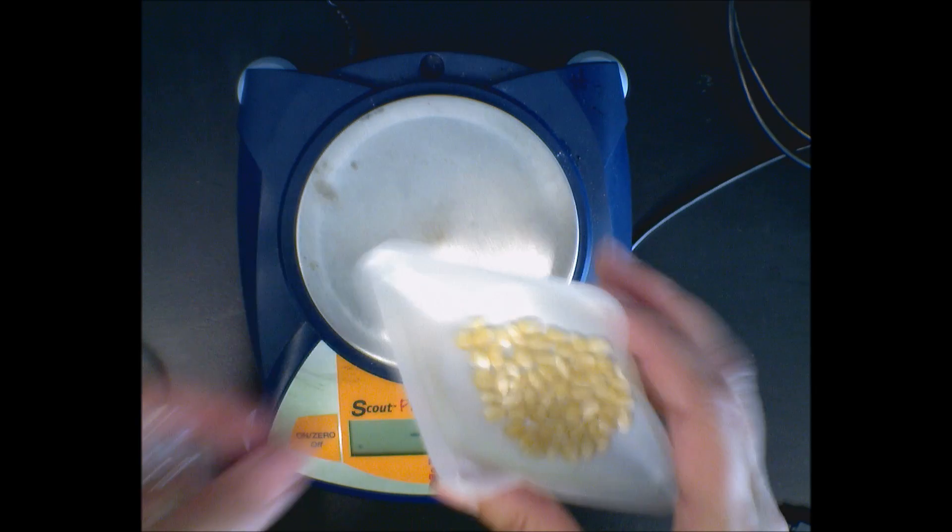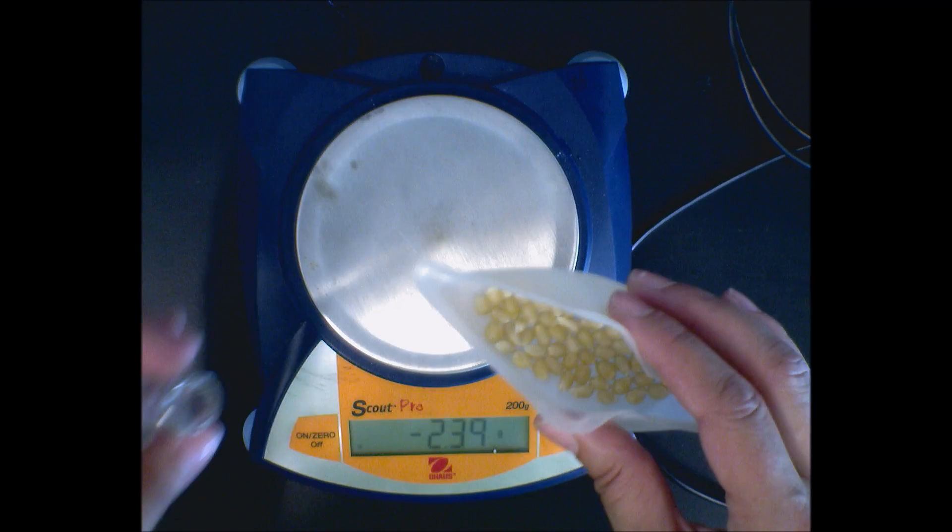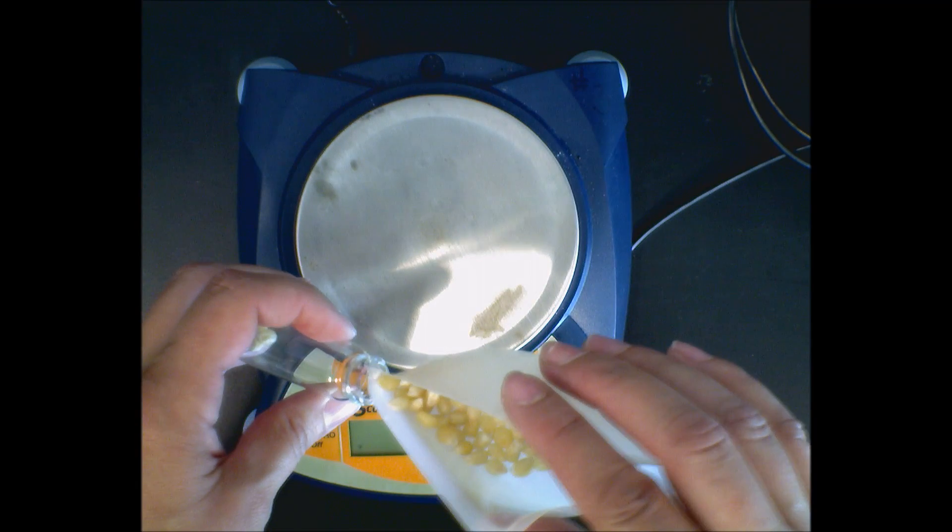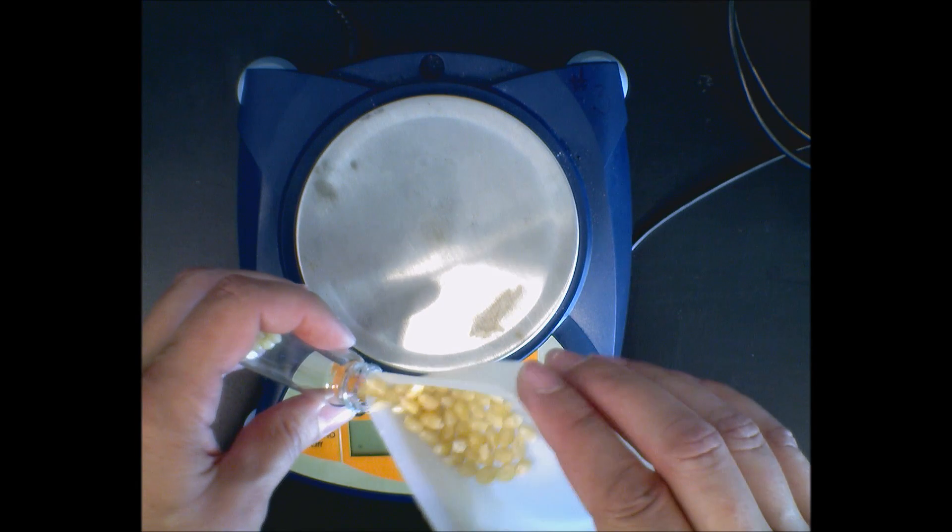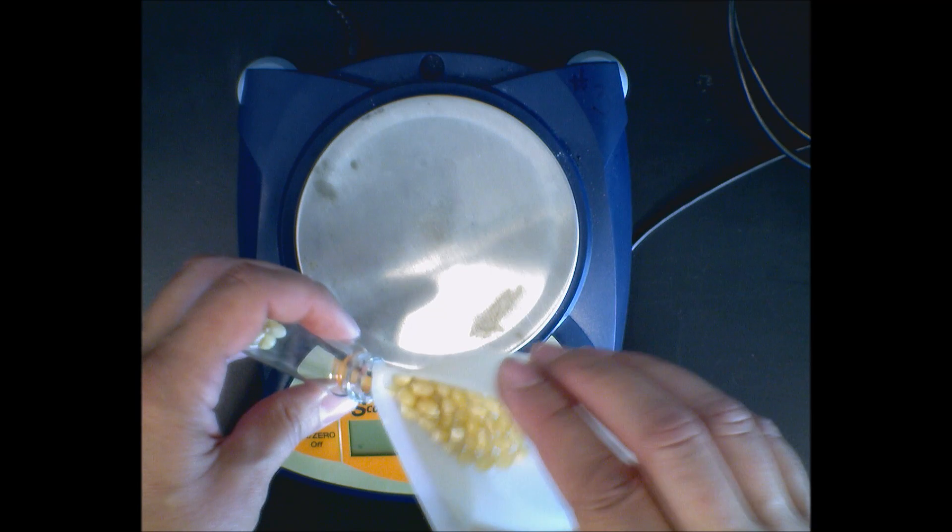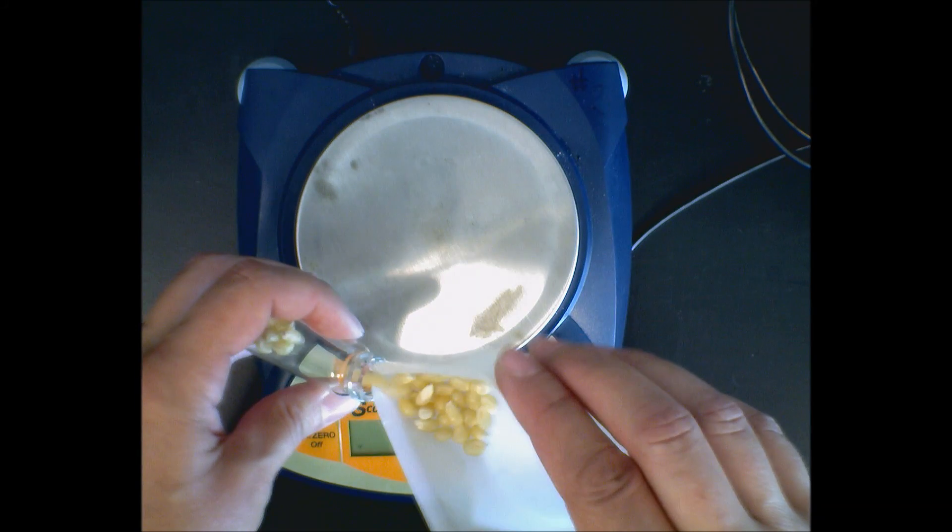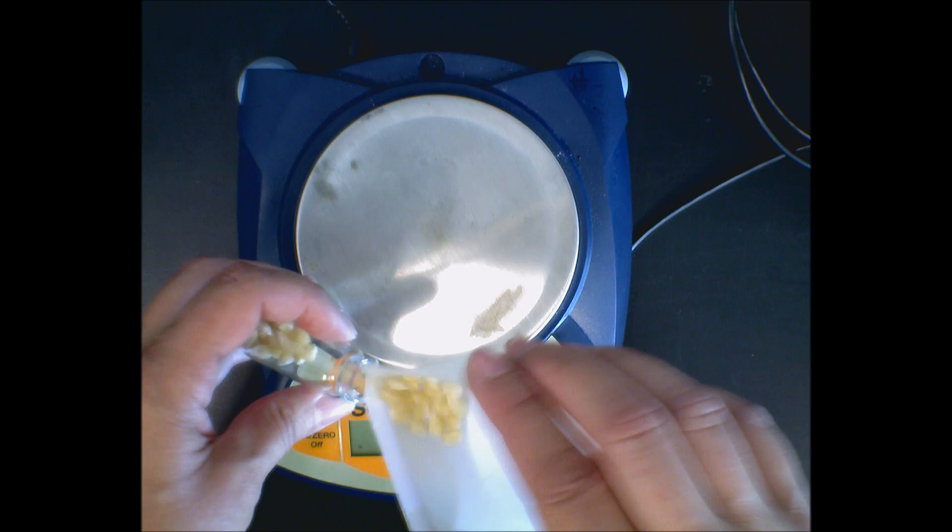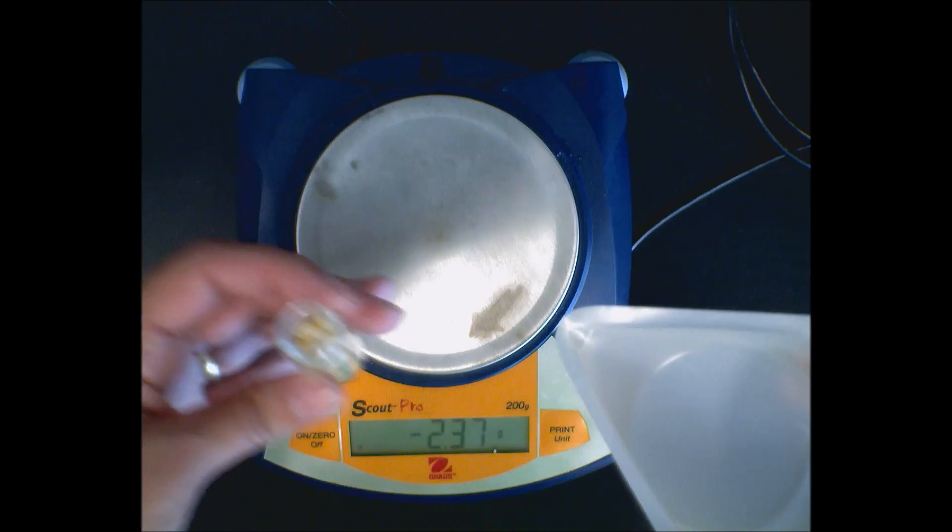Okay, now the weighing boats also have a nifty function of being able to fold so that you can then pour into narrow things if you need to. Notice I squish it and I can get that to go back in the container without a mess.